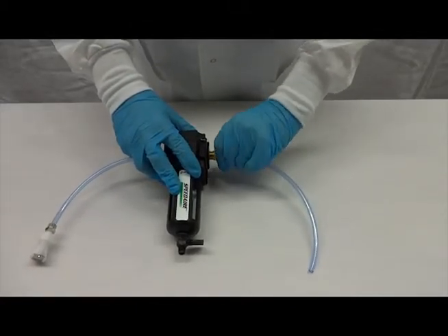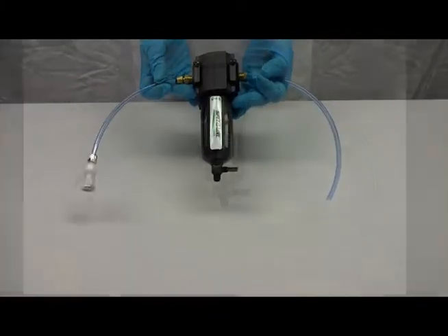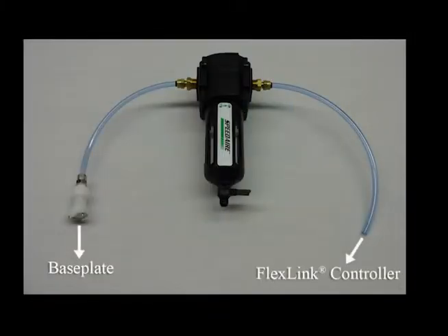Place the water trap at a position lower than the flex-link unit. Check the water trap prior to each experiment to see if water is accumulating. Empty the water trap before it is more than half full.